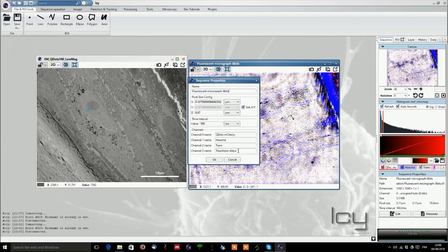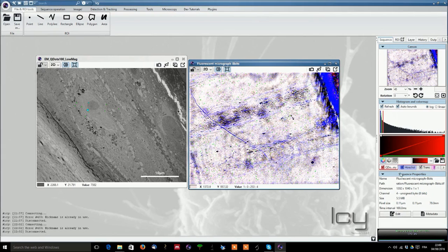Second one is Hoechst, the third one transmitted light and the last one transferrin Alexa. This is helpful when you want to know the name of your channels and not having them sorted just by color.